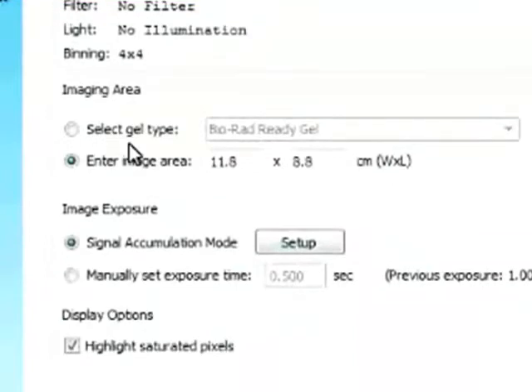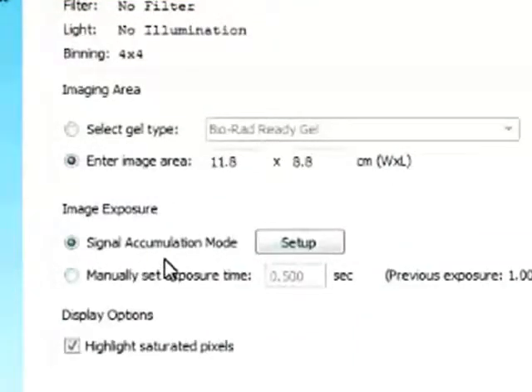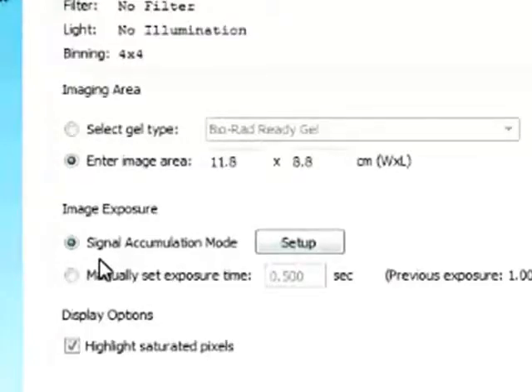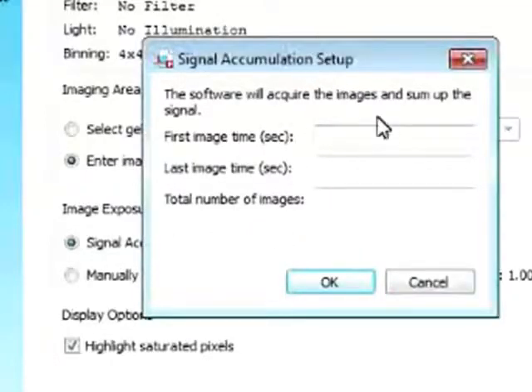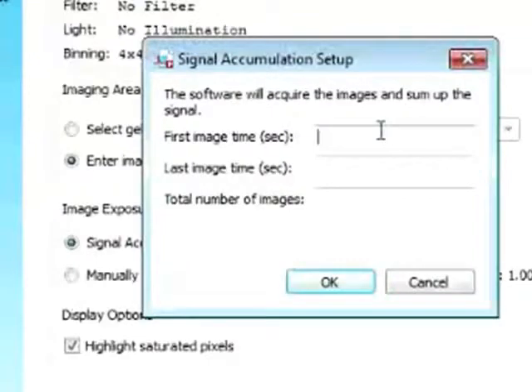We can enter the imaging area. And the nice feature that we have for our chemiluminescent blots is we can set up signal accumulation mode. So if you click on setup, now the software will ask us, okay, what is the first imaging time that you want?